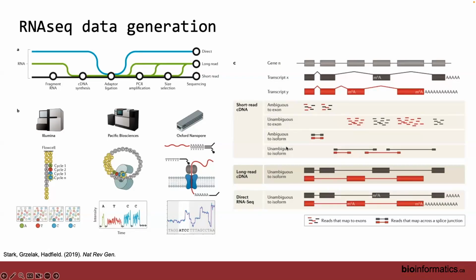the other thing is your process has to be aware of the phenomenon of splicing, right? So in the genome, you have two exons here. They may be separated by a very long intron. When you have a read from a piece of spliced RNA, those two exons are going to be joined. The algorithm that goes to align that piece of sequence had better know that these two parts of the genome can either be far apart or they can be connected. Otherwise, it's going to throw out anything that's been spliced, right?